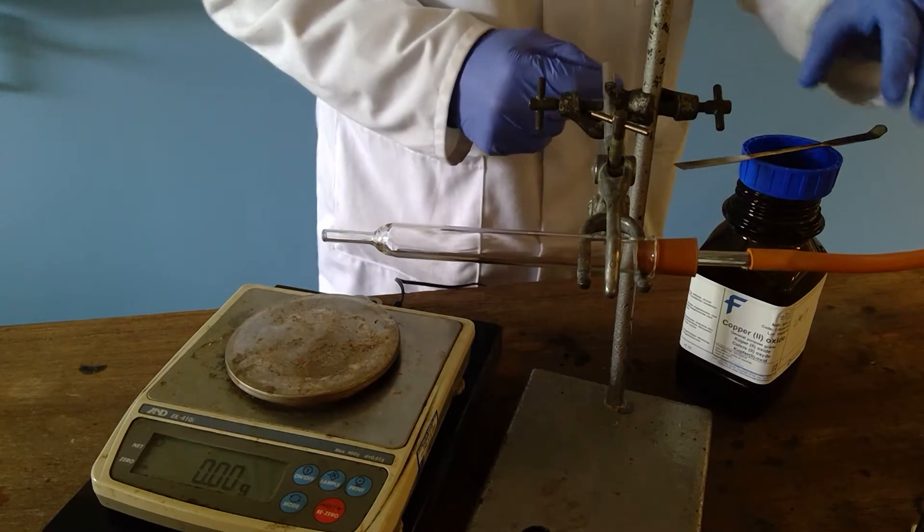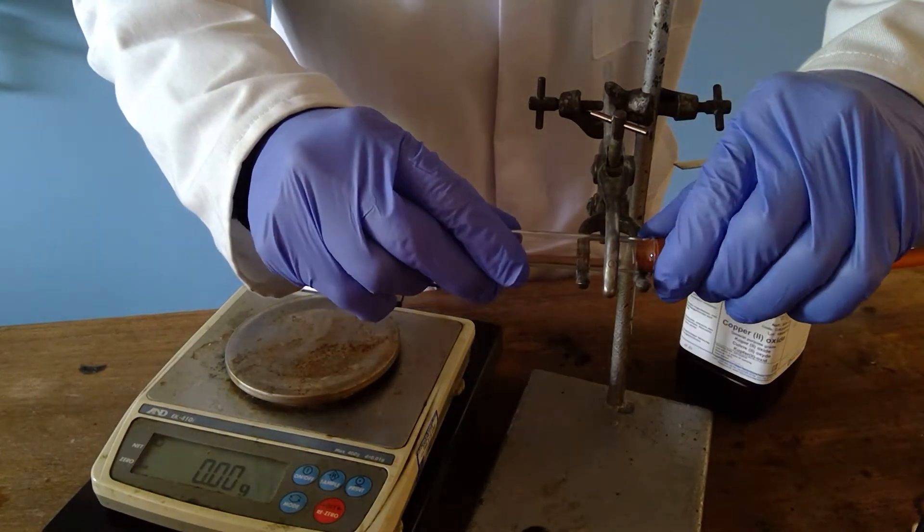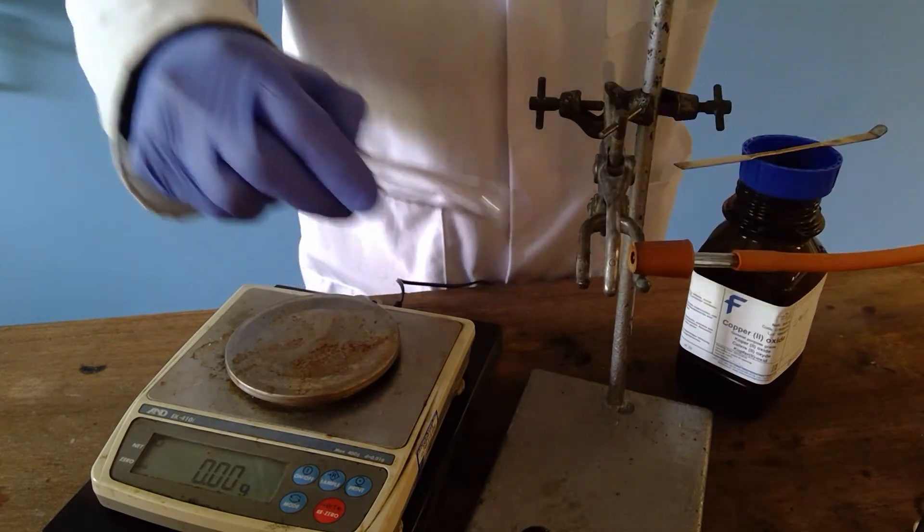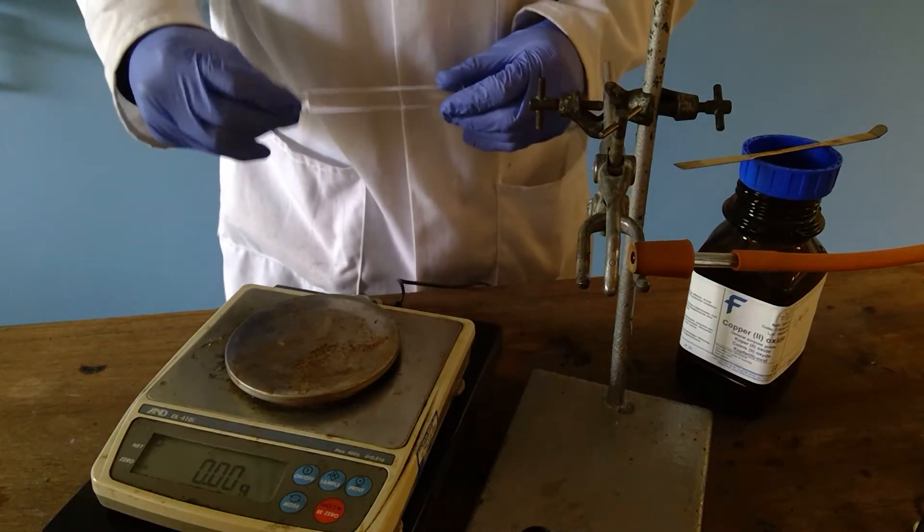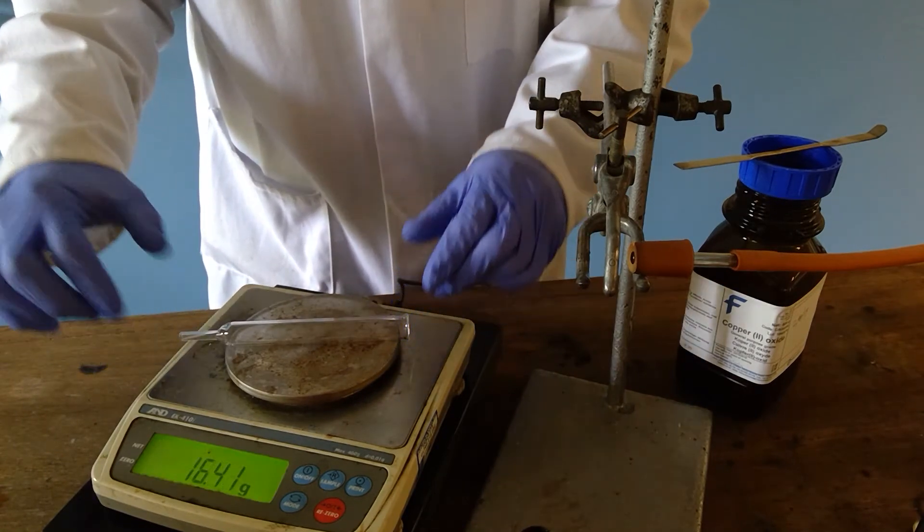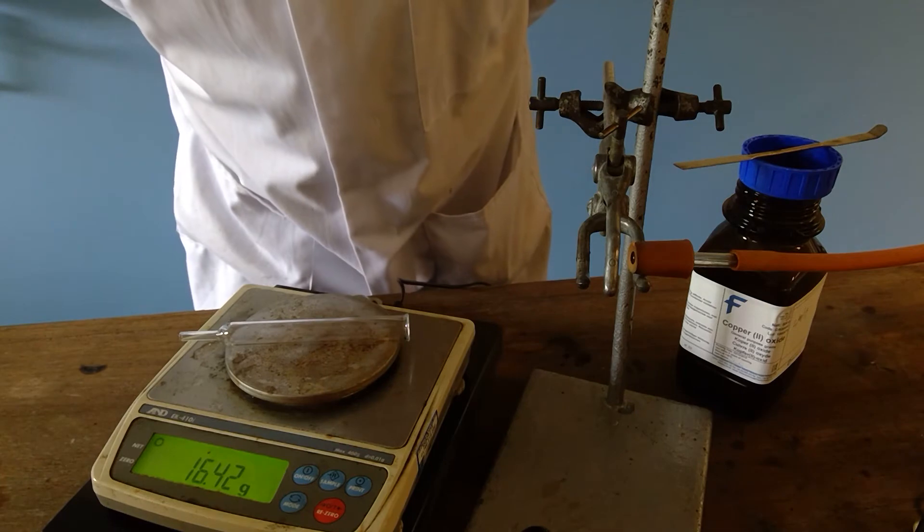The copper oxide is to be placed in this combustion tube. We will weigh the combustion tube first. So if you'd like to take a note of the mass of the combustion tube prior to the experiment.